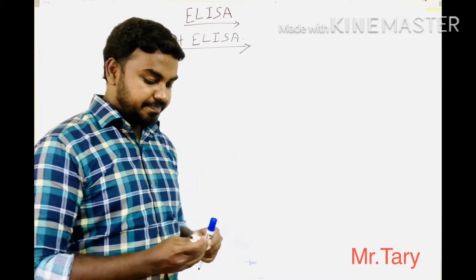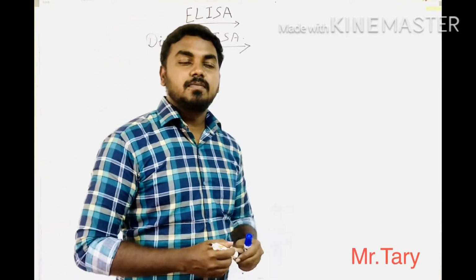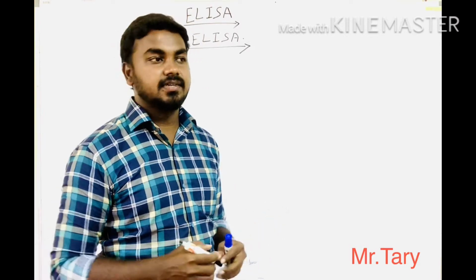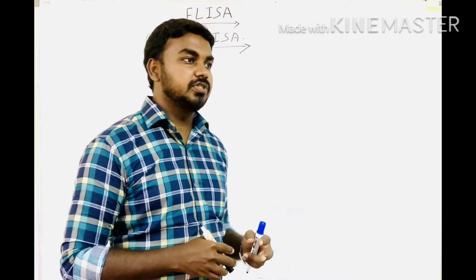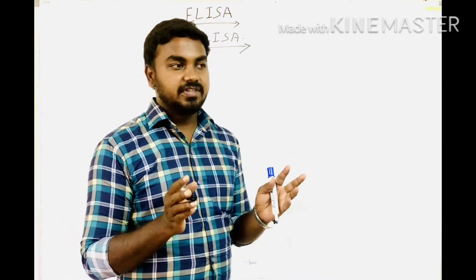Yeah, this is Tary. Today we are going to learn about a direct ELISA. In previous classes we have seen indirect and sandwich. Okay, now we should know what the difference is.